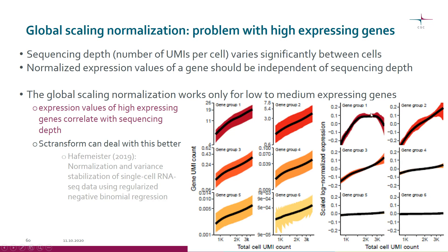However, for the high-expressing gene groups, the normalization doesn't actually flatten out at all — these are the problematic ones. There is still a relationship where cells with more total UMIs tend to show higher expression values for a gene, which is non-biological variation that we need to get rid of.